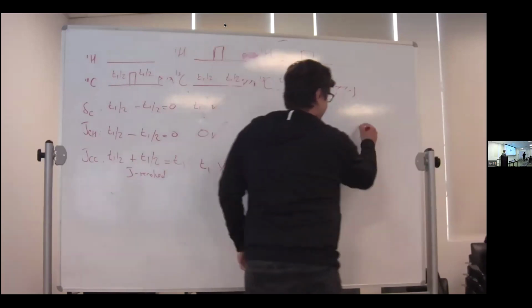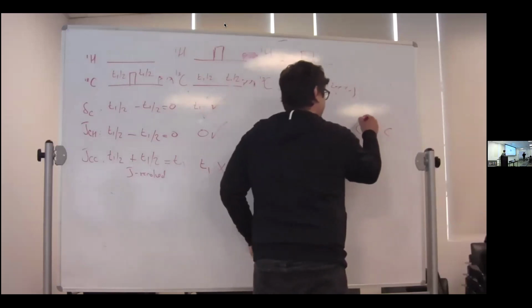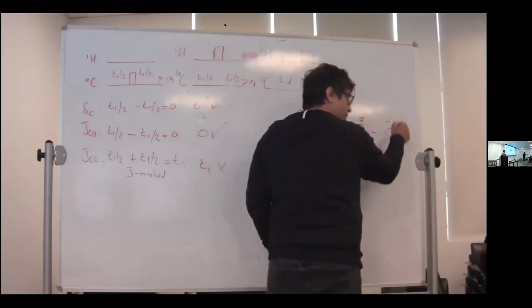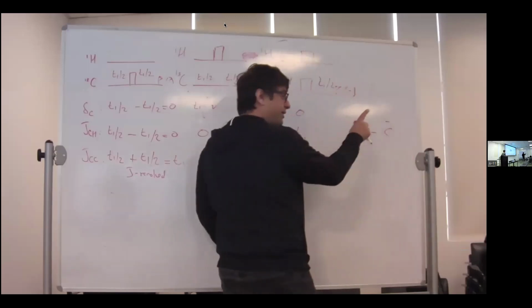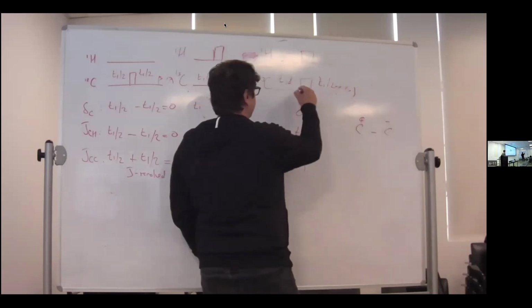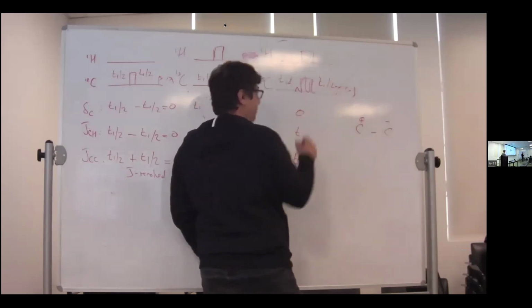So you have a carbon and another carbon. This is the carbon for which I want to measure the splitting. This is the passively coupled carbon. Let's make the 180 on this carbon, like you suggested. I'm going to do a little funky looking selective pulse.